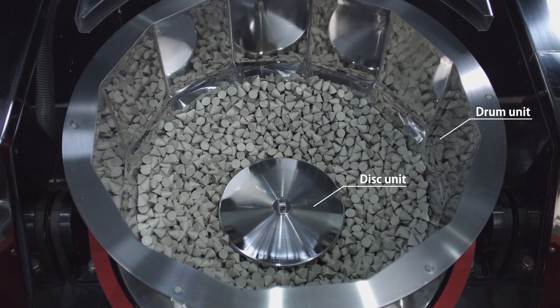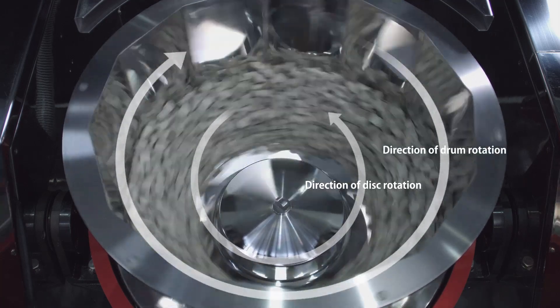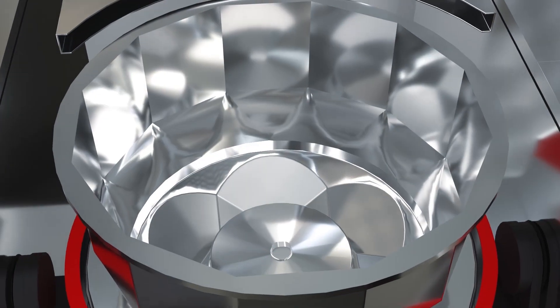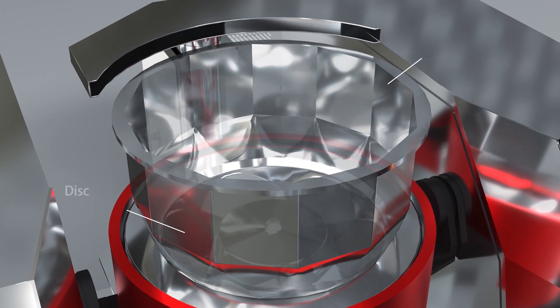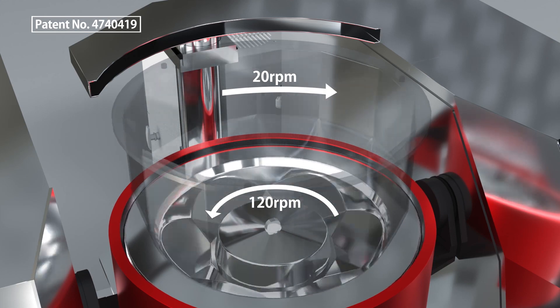The most distinctive feature of ECX is the patented multi-spin structure, in which the drum and disc rotate independently. With this technology, ECX can firmly apply vortex flow to all kinds of pieces for quick and uniform processing, regardless of shape, hardness, and size. The processing chamber of ECX is made up of the bottom disc and top drum, where the specially shaped disc rotates at high speed.